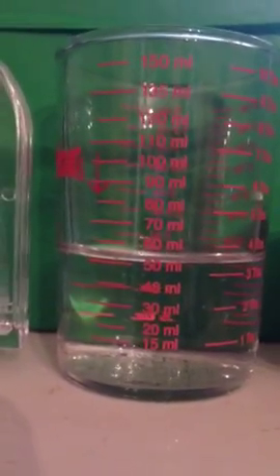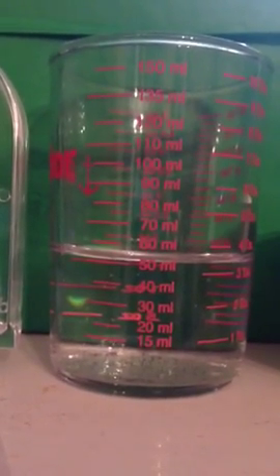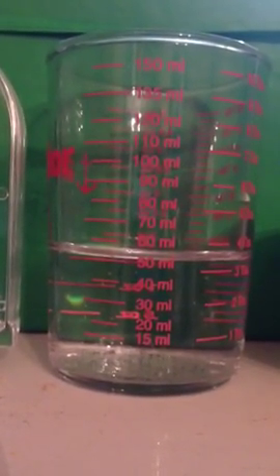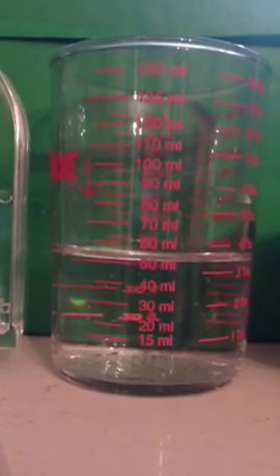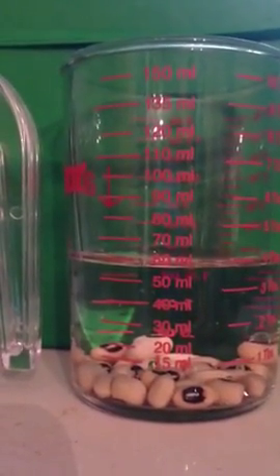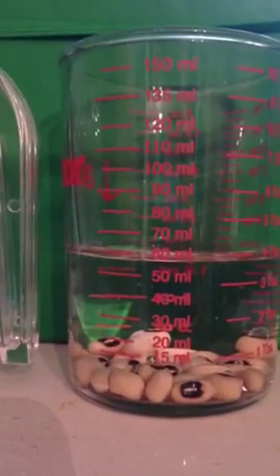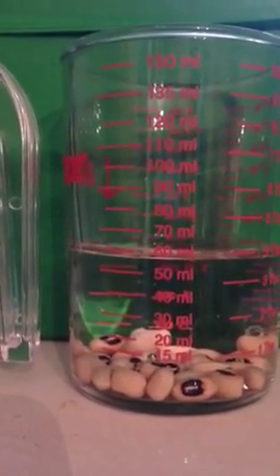And what we're going to do is, we just measured this in our last part of the video. So we determined there's about 50 milliliters of liquid in here. And we're going to watch and see how far the water level rises when we add our black-eyed peas to the solution. And that's going to represent the volume of the black-eyed peas. So there we go. Let's see what kind of volume change we're able to observe, again at eye level. And it looks like it rose to close to 60.